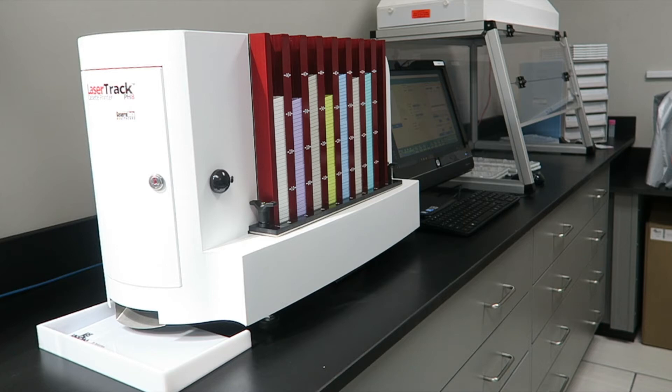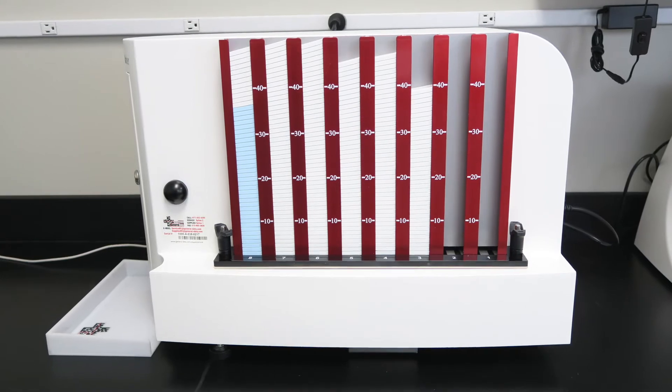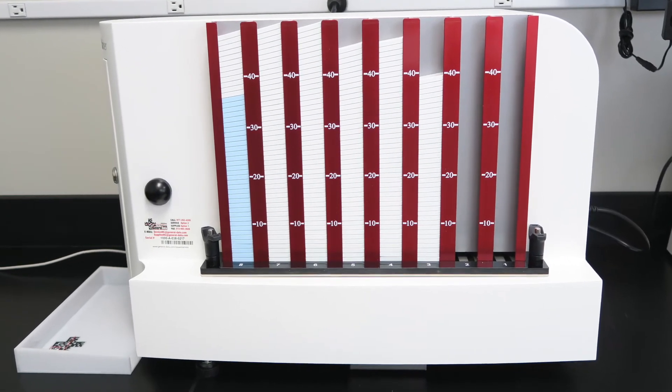This is the LaserTrack PH-8 cassette printer, a great way to increase reliability and workflow productivity in your lab.